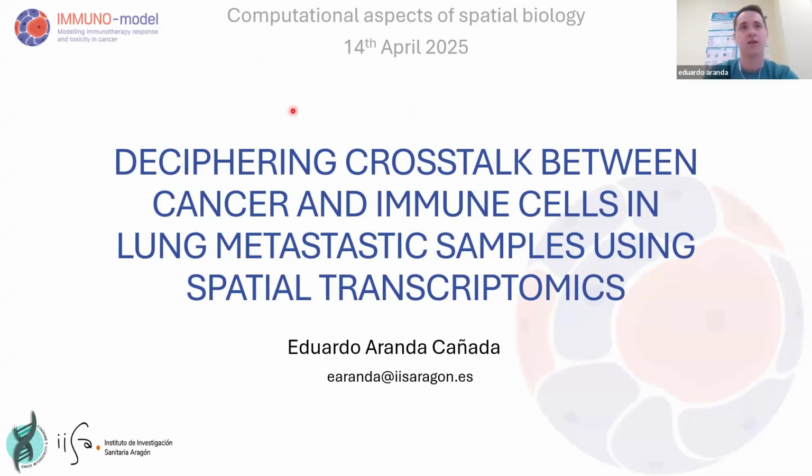Good afternoon, everyone. I'm Eduardo Aranda. I'm a pharmacist and bioinformatician, and currently I'm doing a doctoral thesis in Dr. Rebeca Sanz's research group, Cancer Heterogeneity and Immunomics, in the Aragón Health Research Institute. Today I'm going to talk about deciphering the crosstalk between cancer and immune cells in lung metastatic samples using spatial transcriptomics. I will also explain the techniques and highlight the key points in analyzing this type of data.